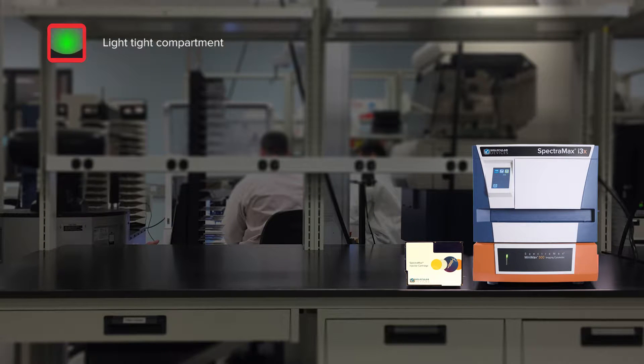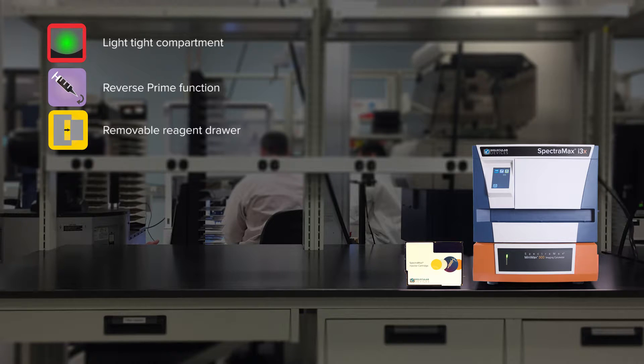Additional features include a light tight compartment to reduce interference and maximize your assay's luminescence, reverse prime function to reduce reagent dead volume to 10 microliters, and a removable reagent drawer for easy cleaning and sterilization.